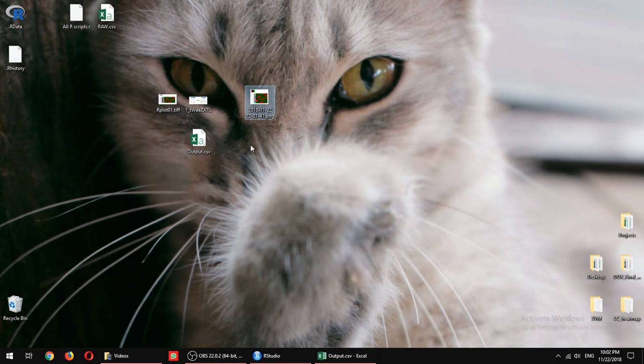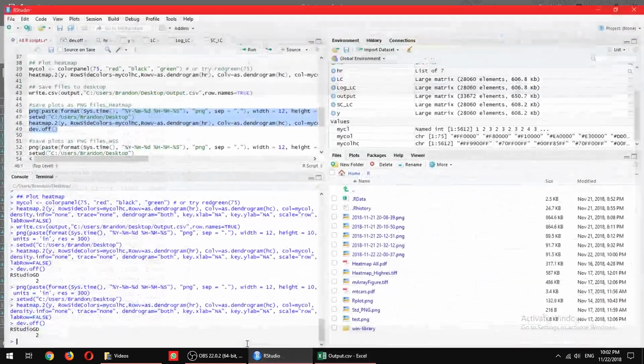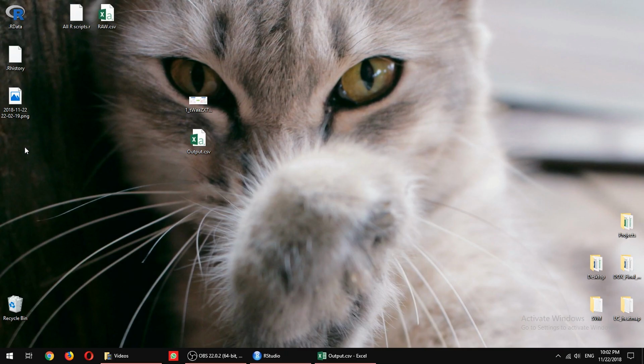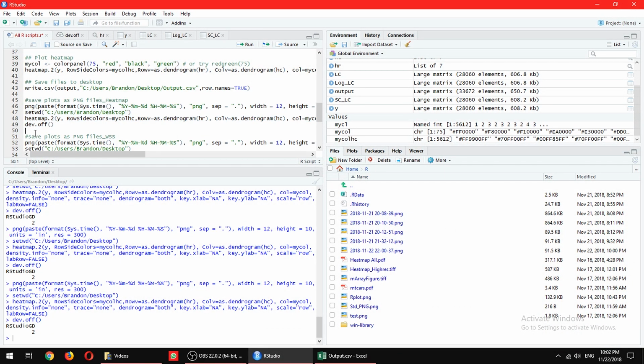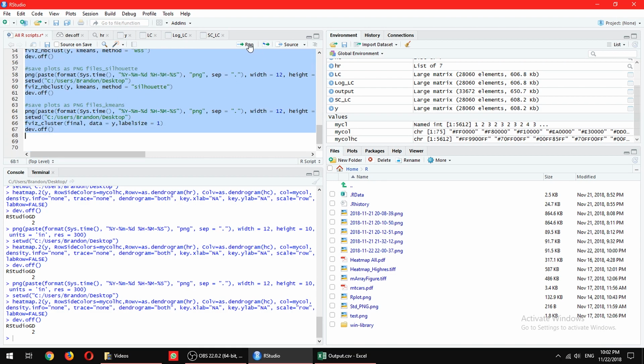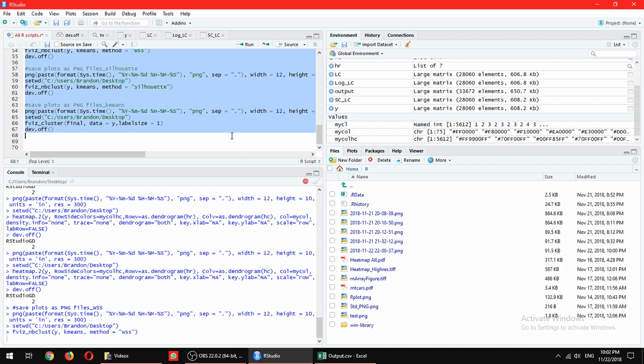Let's just regenerate this again, because there are some errors that you may not be familiar with. Let's generate this again, just to make sure that I'm doing it correctly. Yep, it got generated perfectly. So the code worked perfectly, there's no problem with that. Once we have done the heat map, you can do everything the same way. If you do not want to understand, the code is exactly the same. You just press run and everything will work.